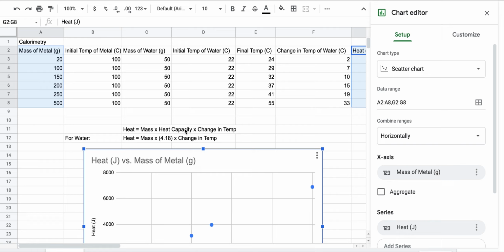In part 1 of our lab, we did the heat capacity. We looked at different substances. Okay? So the heat capacity in the previous part 1 lab was the different substances. And we looked at iron and copper and aluminum, and the heat capacity also had an impact on how much heat. Okay? So part 1, the previous lab, we looked at heat capacity, and now today we looked at mass.